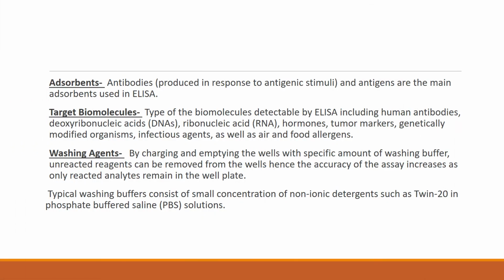Adsorbents. Antibodies and antigens are the main adsorbents used in ELISA. Target biomolecules, which are the biomolecules that can be detected by ELISA, include human antibodies, DNAs, RNAs, hormones, tumor markers, genetically modified organisms, infectious agents, as well as air and food allergens.